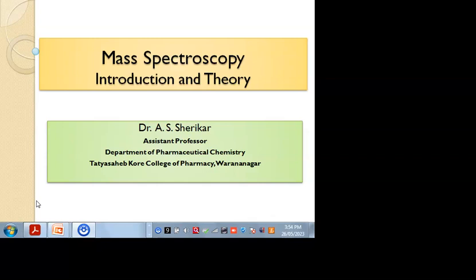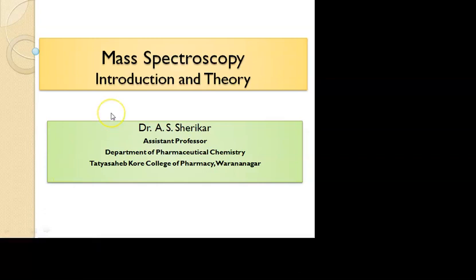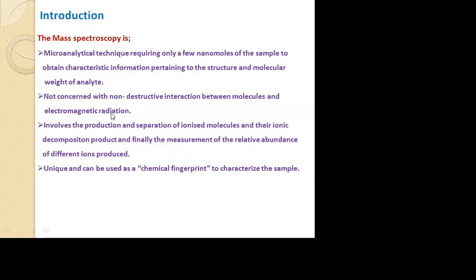Today we will see some introduction and theoretical part of mass spectroscopy. In mass spectroscopy, generally molecular masses are recorded, and those molecular masses which are recorded sum up to be equal to the molecular weight of the chemical compound.